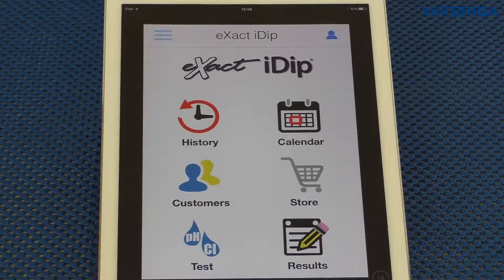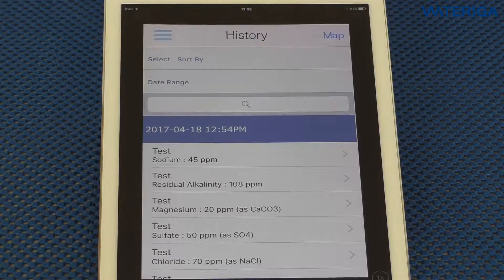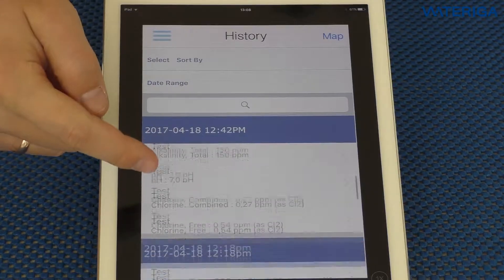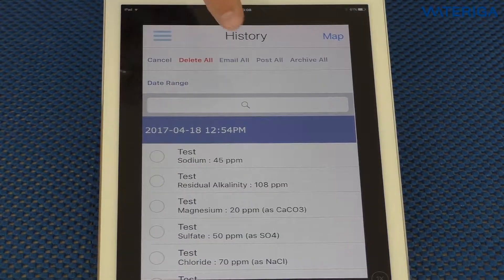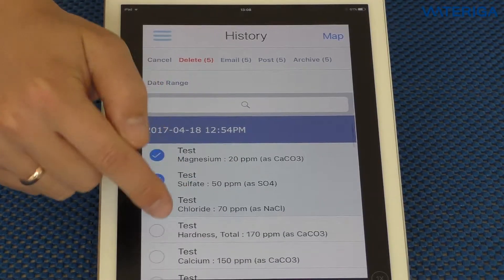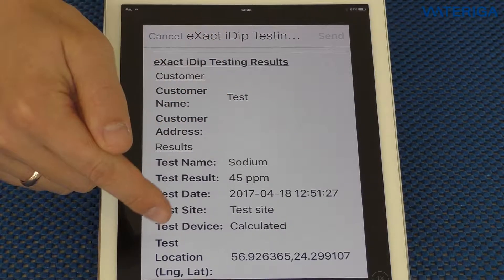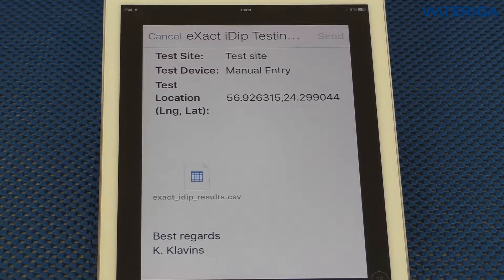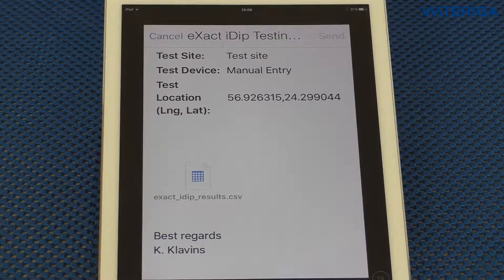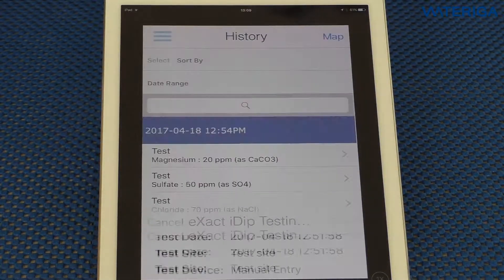One of the core features of this app is the history. Once you hit history, it shows all the test results done today and before in your app. If you would like to send them, you can email them to yourself or to your customers by hitting select, then either email all or select various tests. Select email and it composes an email with customer name, test site, and all the results with date and time. At the bottom of the email, it creates a CSV file which you can export as an Excel spreadsheet and also create charts, graphs, and logs.